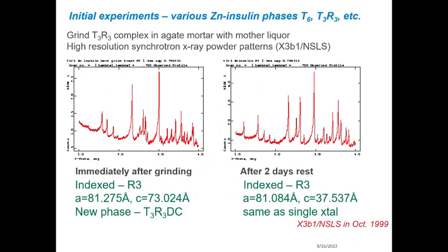So my experiment that Joel mentioned earlier was to look at insulin, and I did something that was horrifying to protein crystallographers. I took single crystals and ground them up in order to make a powder pattern. I wasn't interested in single crystal diffraction. I wanted to do powder diffraction, so I had to grind up single crystals. The amusing thing about this is that those crystals were a test crystallization that replicated one that was done on Skylab at the same time.